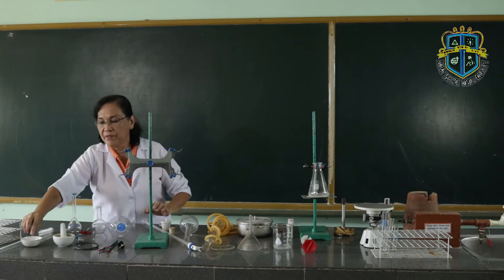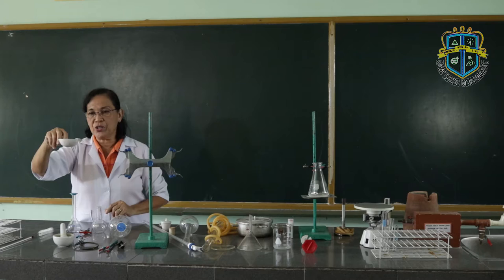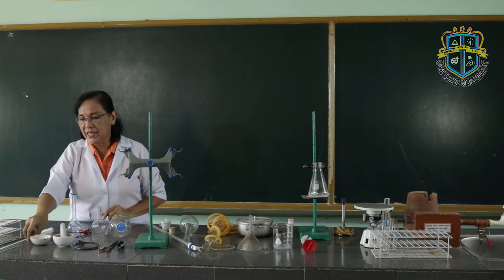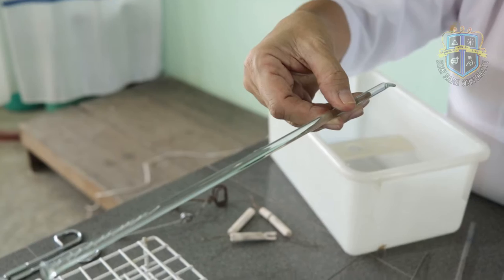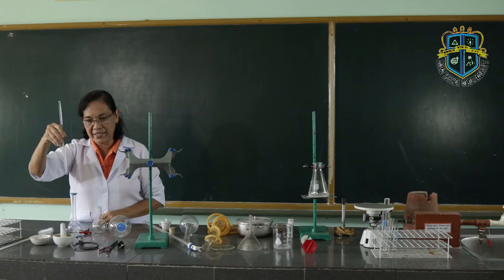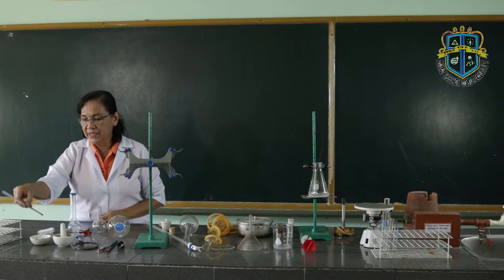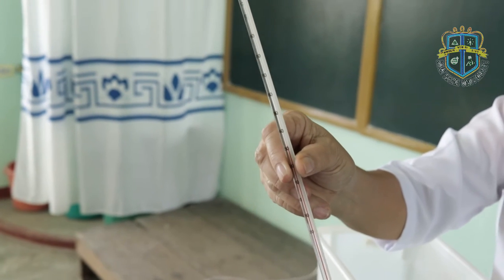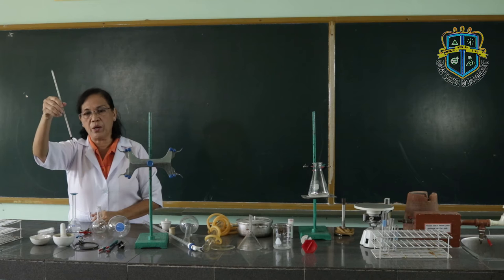This is the evaporating dish. It is used to contain liquids to be evaporated. Then we have the stirring rod. The purpose of the stirring rod is, of course, to stir — for mixing purposes. And this is the thermometer. The thermometer is used to determine the temperature of substances.